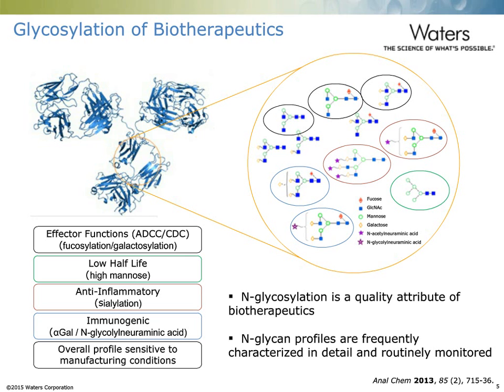Hello. To start off this presentation, I'm going to be talking about the sample preparation aspect of N-Glycan profiling and some of the advances Waters has made in the past half a year or so in terms of developing a new system for both releasing as well as labeling and separating and analyzing N-Glycans.